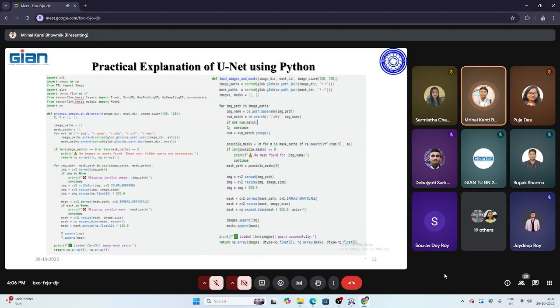If there is a different name, then you have to rename those images with different Python code, because a fixed name is better to extract all kinds of images. You have to keep a fixed name and fixed extension.